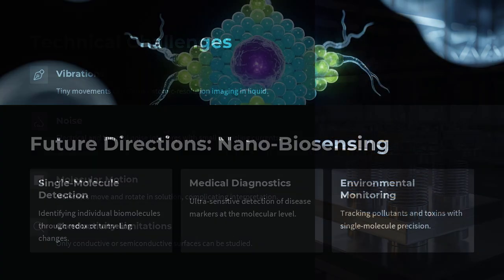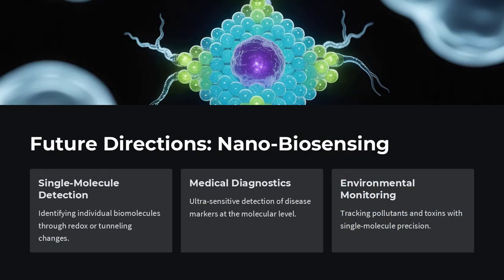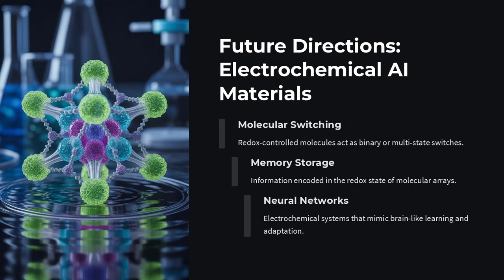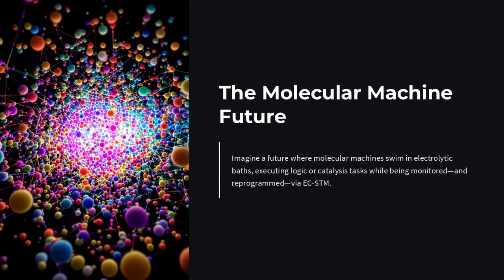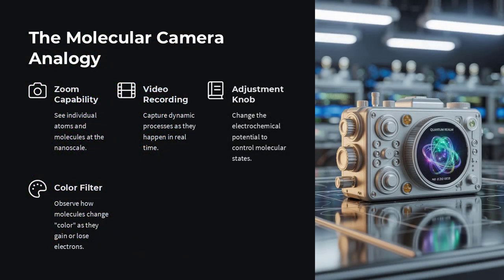With electrochemical scanning tunneling spectroscopy, ECSTS, researchers apply a range of bias voltages and map out the density of electronic states, DOS, revealing how a molecule conducts electricity, responds to charge, or undergoes conformational changes. You can literally watch molecular orbitals appear or disappear depending on the applied potential. Let us ask a deeper question. Can this be used for energy or medical applications?